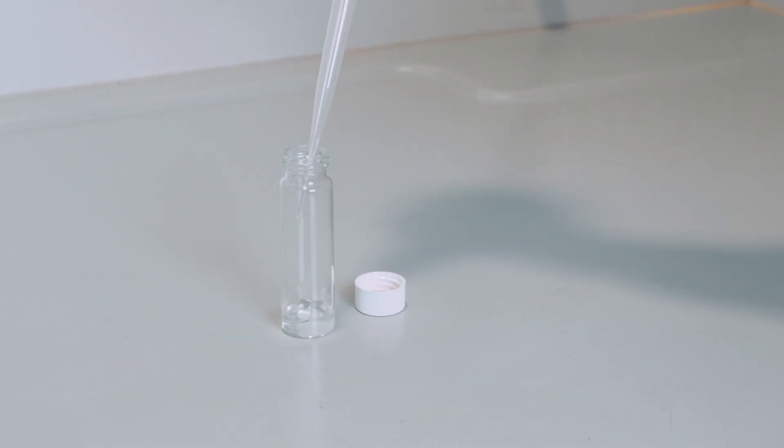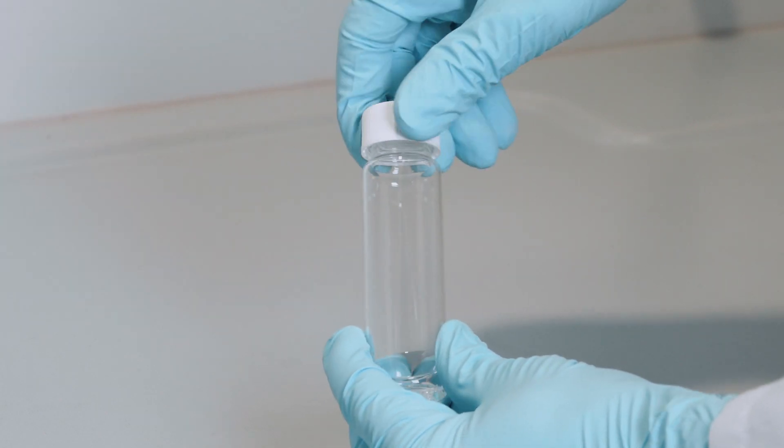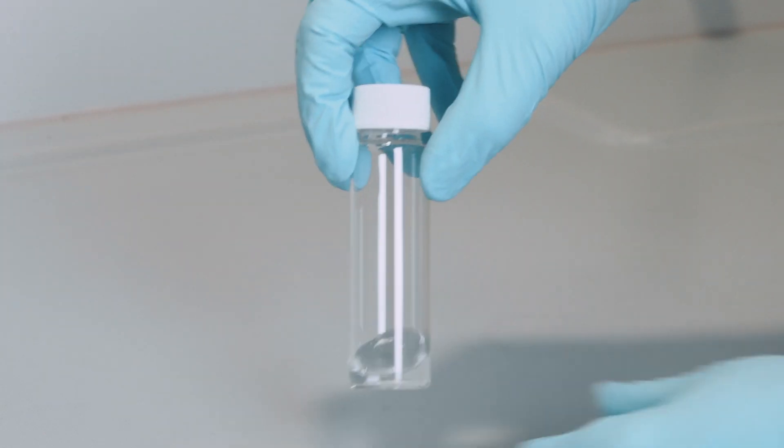Let's see what happens when we try it out on a kitchen microwave in the safety of a lab. Don't do this at home. It's dangerous.